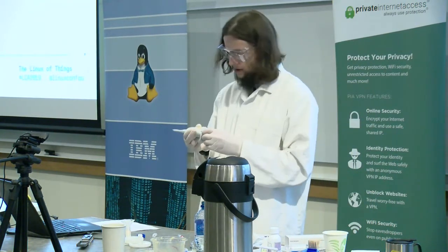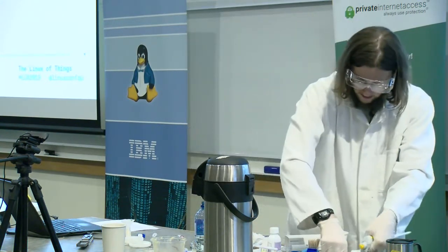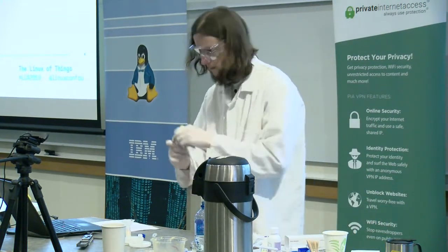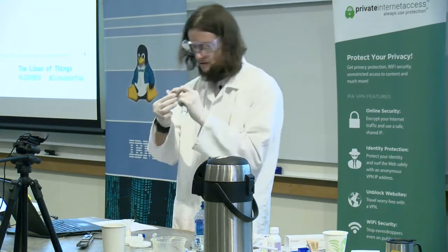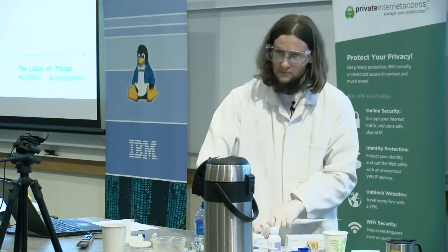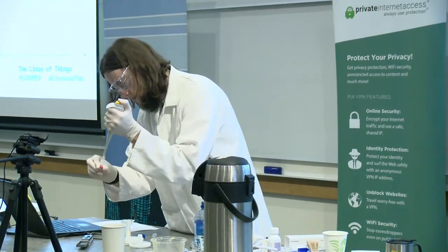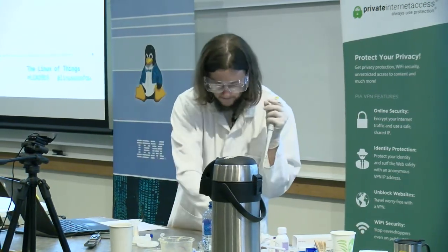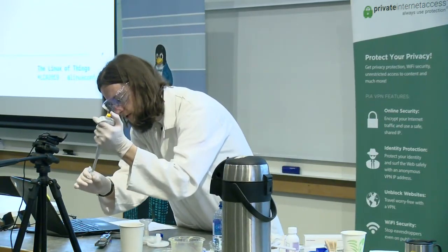The purpose of these loading beads is to allow the DNA to sink down and hit the nanopores. Oh, that's not loading beads. Okay, so these get added in.